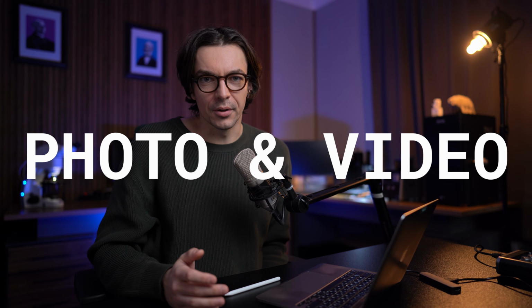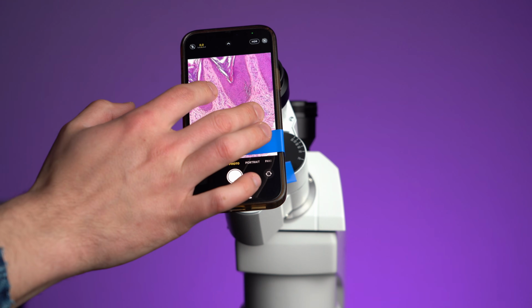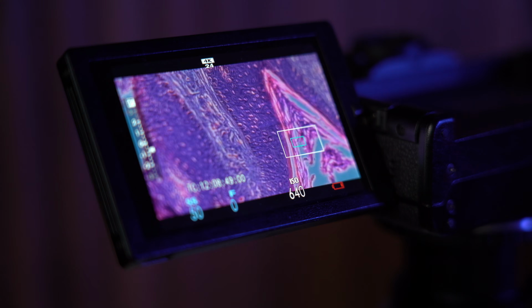Photo and video capture. In this budget you really only have two options: a smartphone or a camera with interchangeable lenses. The second option is better. A used DSLR works great. Crop factor around 1.5 is perfect. You don't need a lens, just the camera body. Forget about dedicated microscope cameras at this price, image quality will be terrible.